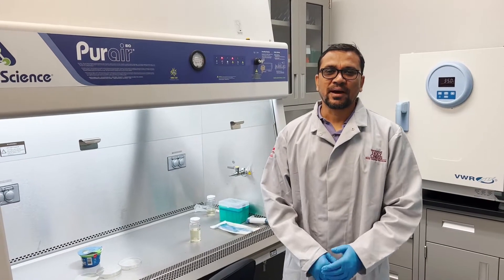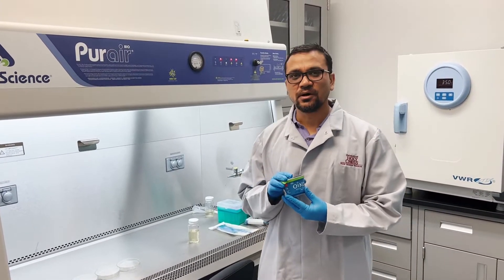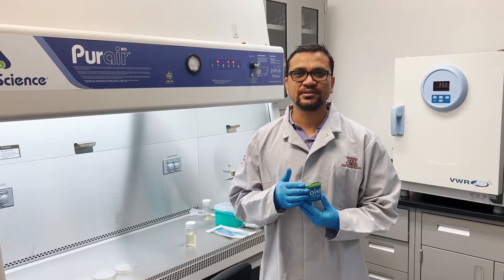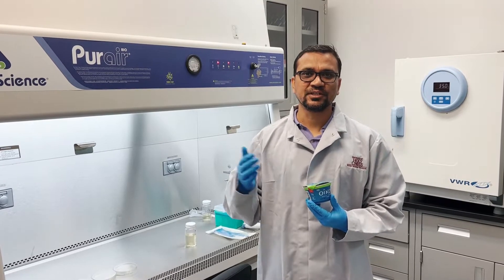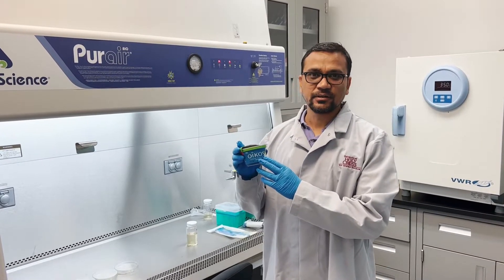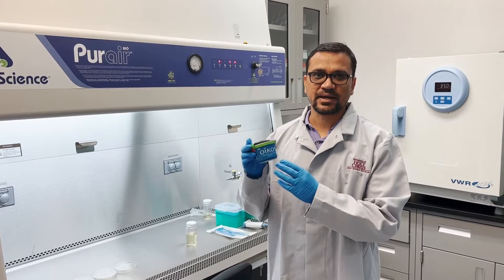Today I am going to grow microorganisms or bugs in a Greek yogurt. Microorganisms are too small, so we first have to grow and multiply them in specific conditions, and we use the microscope to see them. People eat Greek yogurt because it has high protein and billions of beneficial microorganisms.